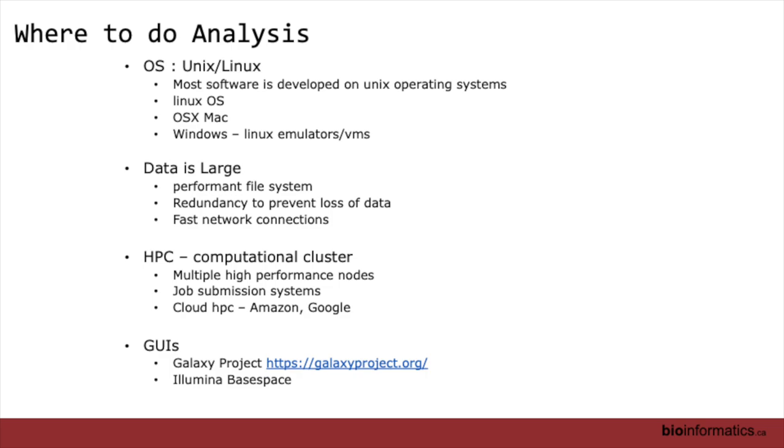There's ability to do this in cloud as well, Amazon, Google Cloud. It's all HPC systems up there. Gives you a place to work with that stuff if you don't have your own systems on premise.